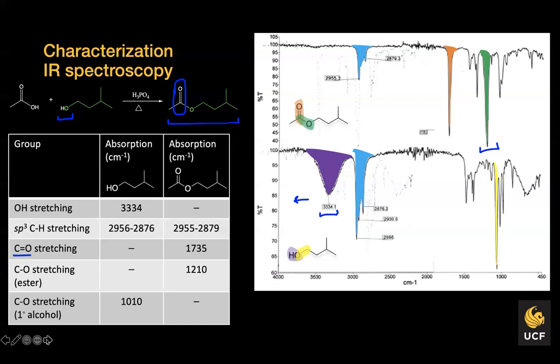If you take a look at an IR spectrum closely, you could definitely identify that the reactant has been converted into product, and that we don't have any of the reactant left in solution, right? Notice, you don't really have this alcohol peak in the product. So all of the reactant has been converted into product. Okay, any questions on IR?